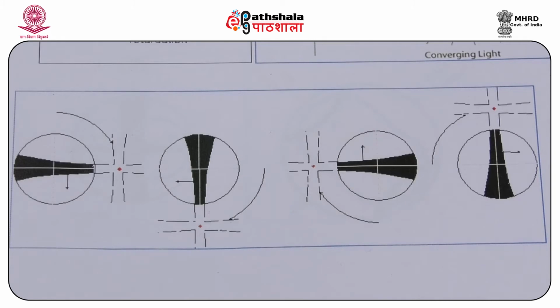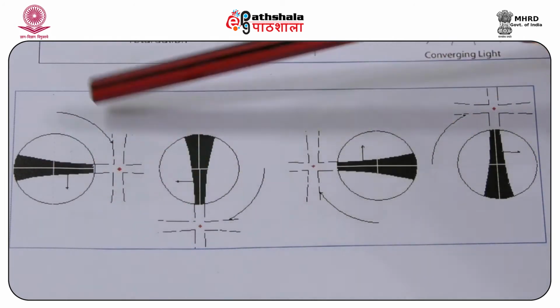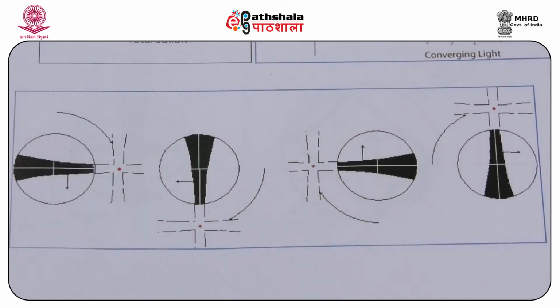When the optic axis is within about 30 degrees of being vertical, the melatope is visible in the field of view, resulting in an off-centered figure. As you can see here, this is a kind of an off-centered figure. Such a figure we call an off-centered optic axis figure.